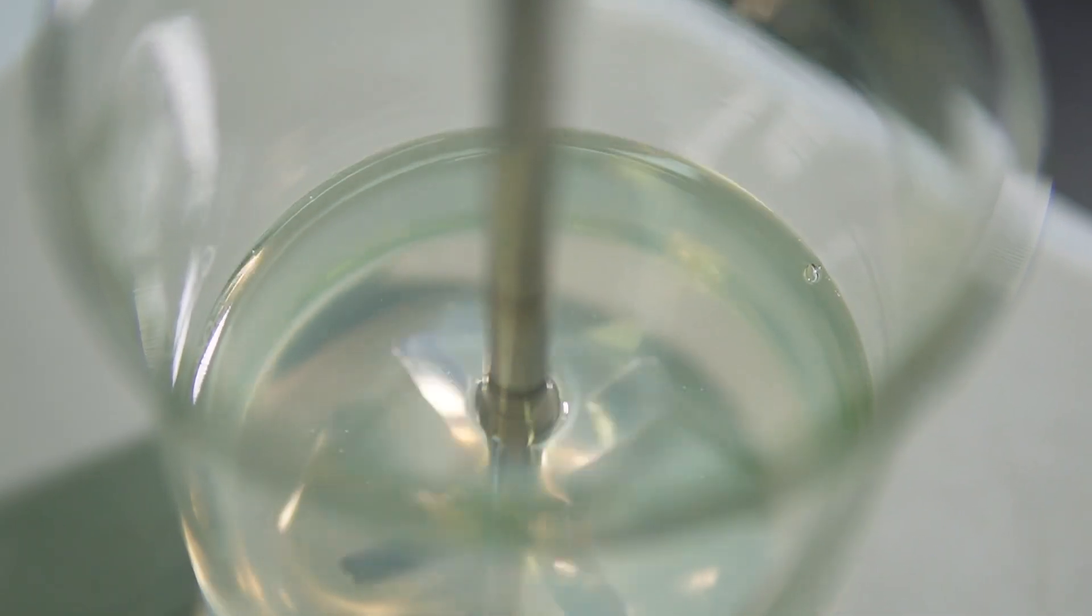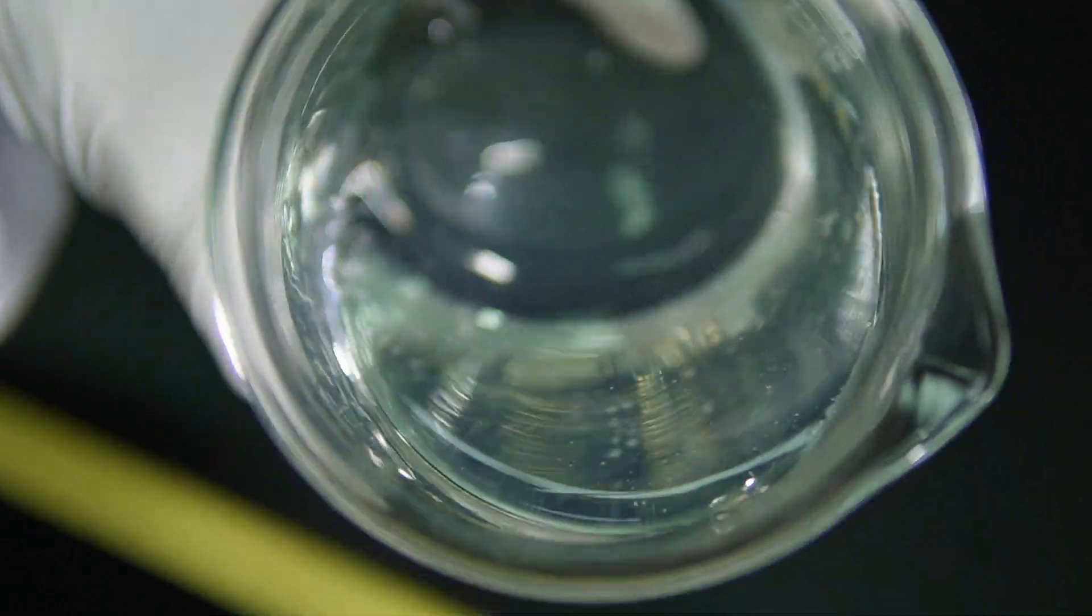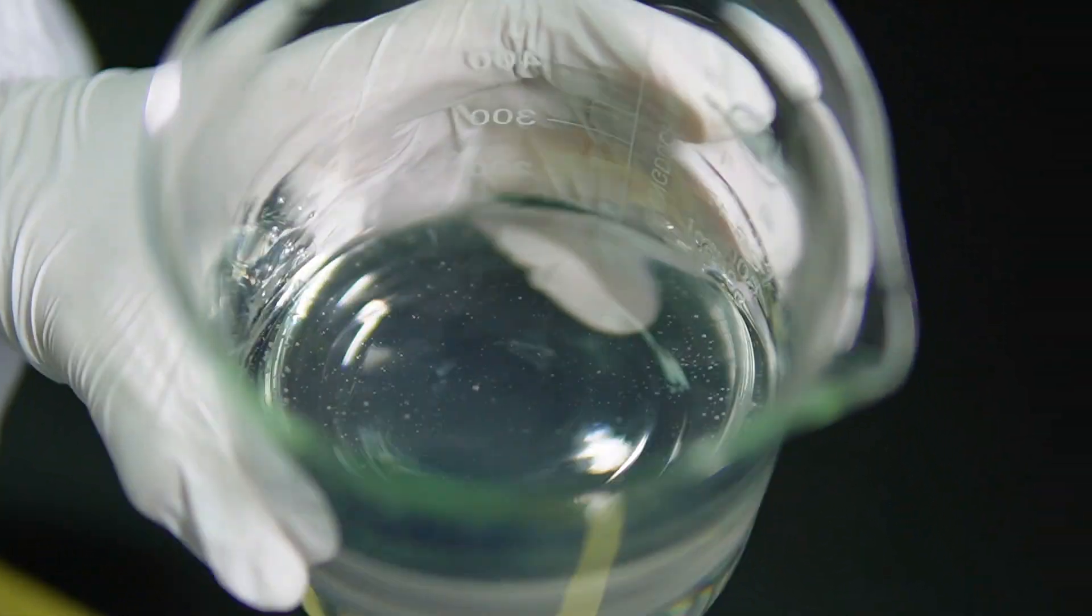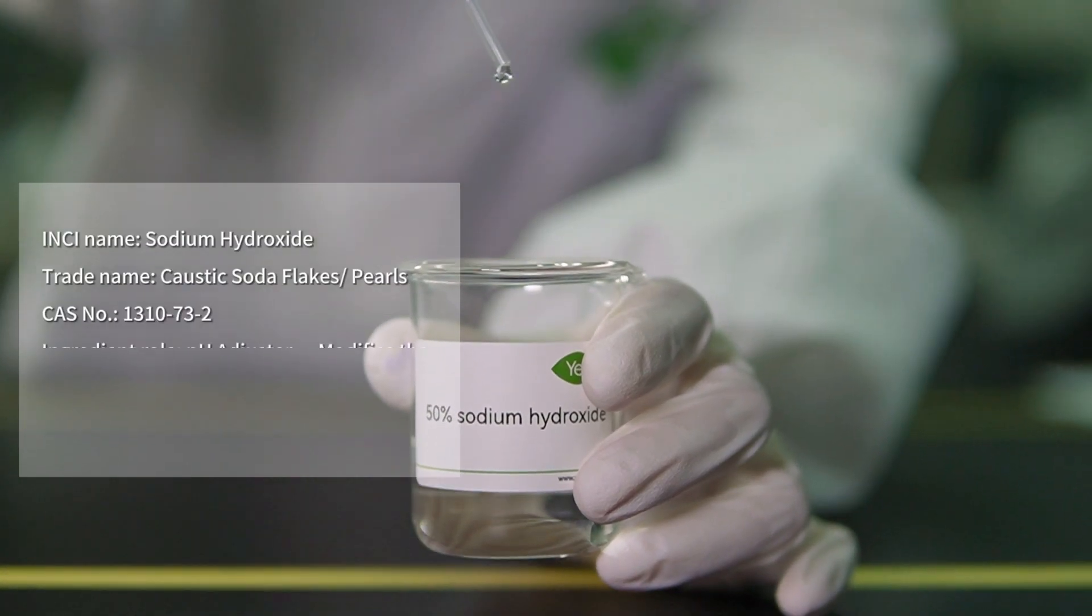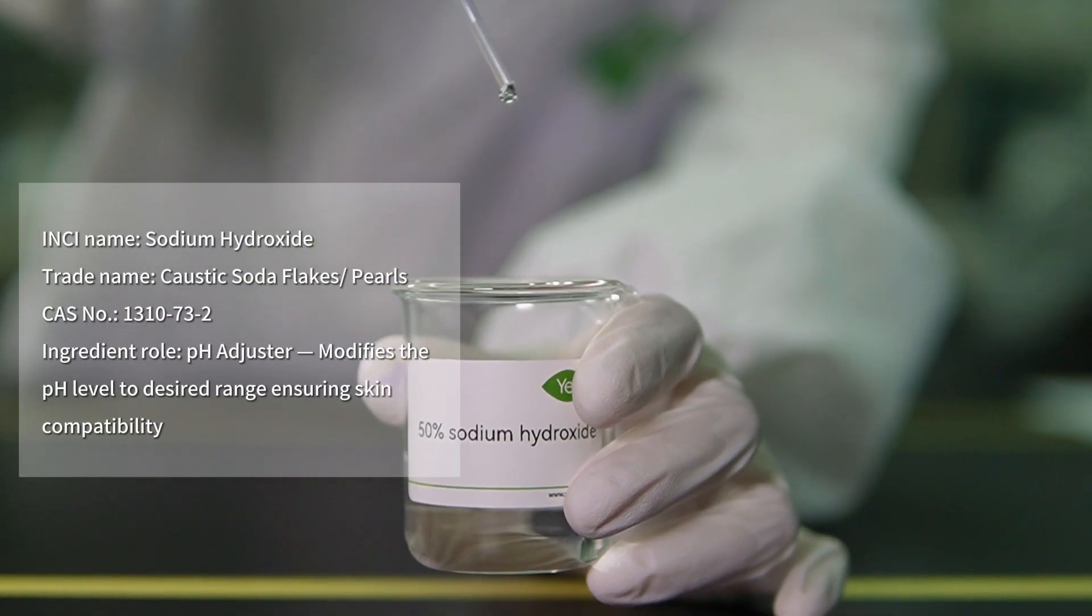And while we're doing all this, we keep the slurry stirring at a steady medium speed. It's a bit like baking, you've got to get the mix just right. As we delve into Phase E, it's all about perfecting the details and adding that final flourish.